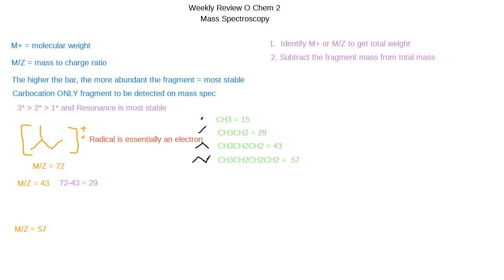Now there are multiple ways I can cut. I can cut this way. I can cut right here. I can cut right here. I can cut right here, okay? So I have 4 different ways.